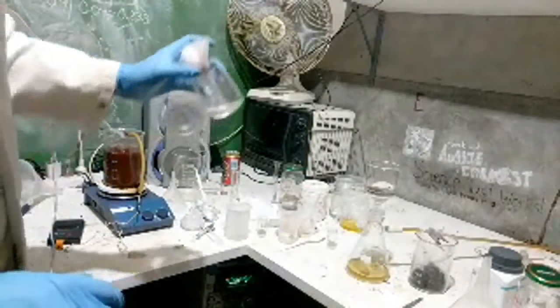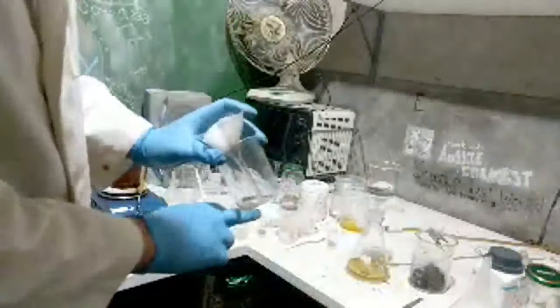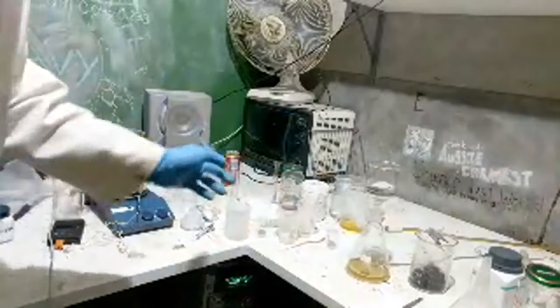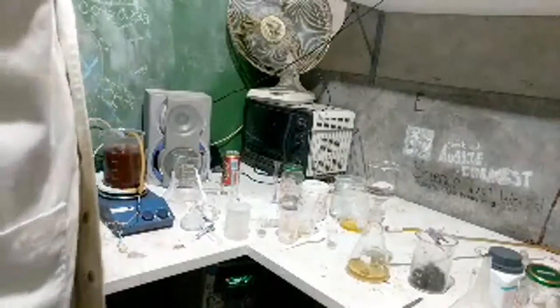Well, nah, because that's not even barely pink. There's nothing in that at all. Oh, it could be chlorite crystals as well. Oh no, potassium. We have put potassium in there, so it's probably potassium chloride. Yeah, iron hydroxide works.